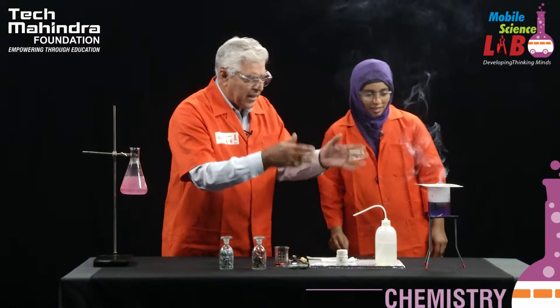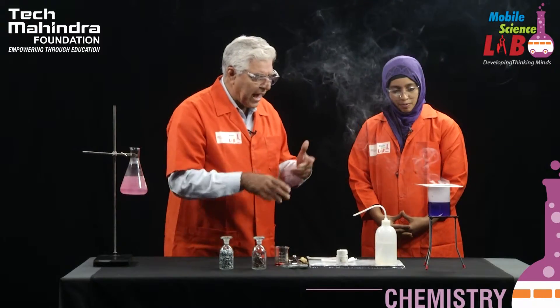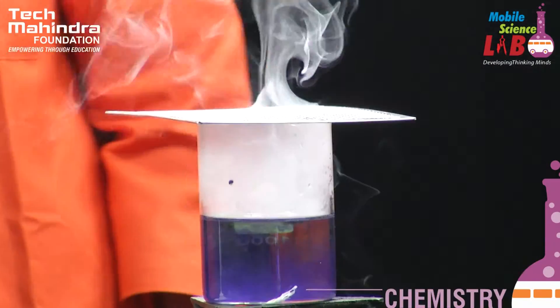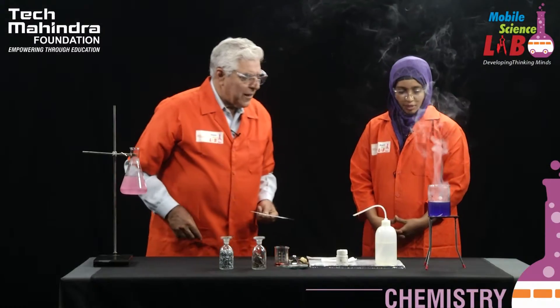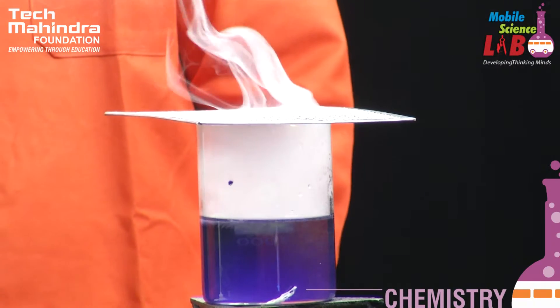You can see there is a vigorous reaction — lots of smoke also coming. That smoke is a combination of steam as well as hydrogen gas coming out. Now this reaction is producing alkali. Also, it is not sinking — it is floating on the water! Wonderful observation and a very good question. Sodium is a very light metal, and as soon as the reaction starts, the hydrogen pushes it up to the surface. You can see it is now running round and round. There are two important changes: one, sodium is on the top, running like a mad chicken; and the second is that the colour has changed from green to purple.